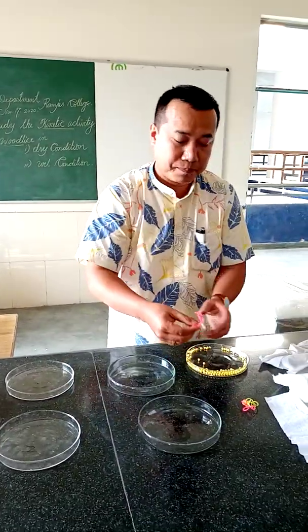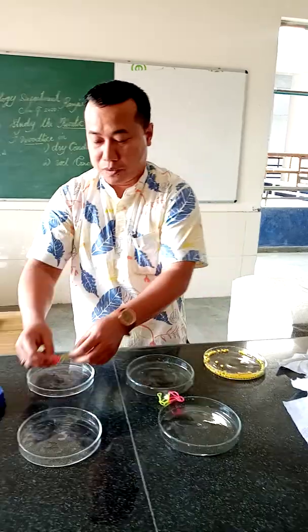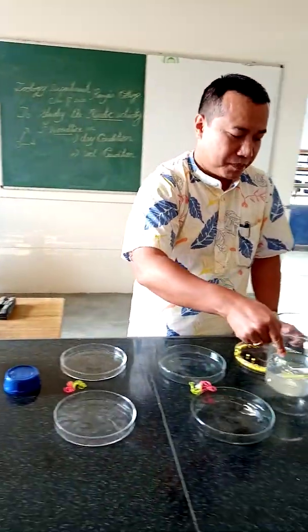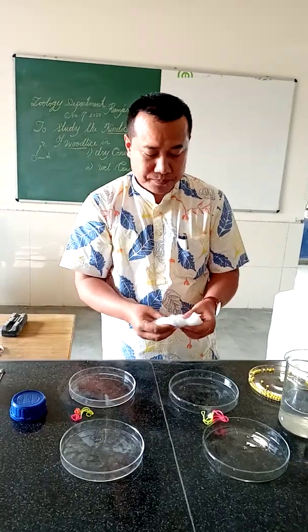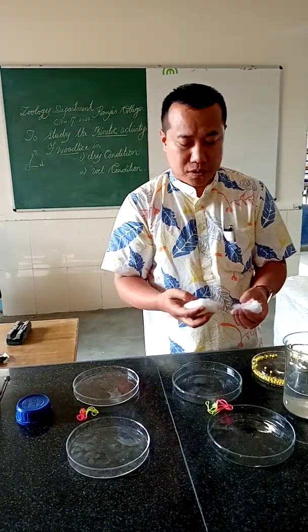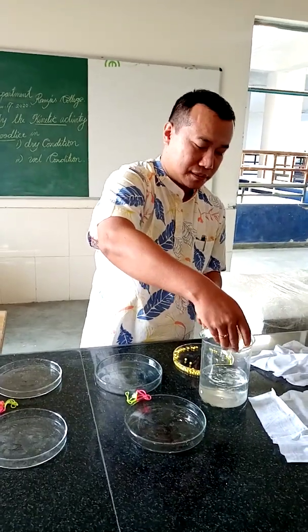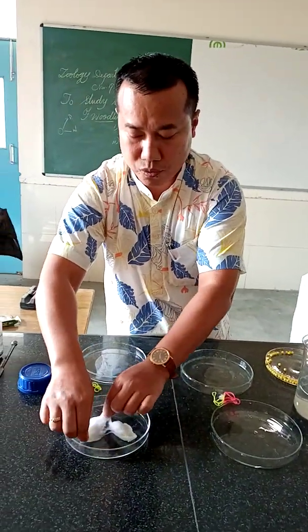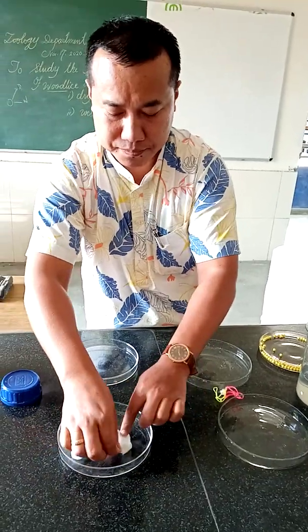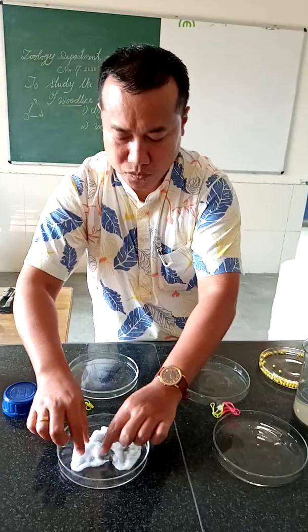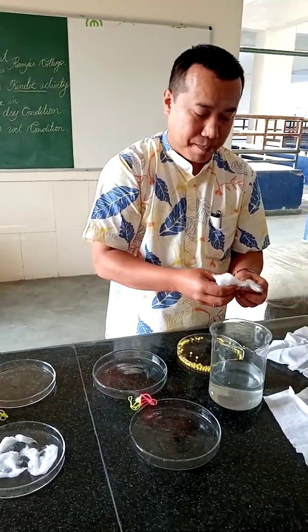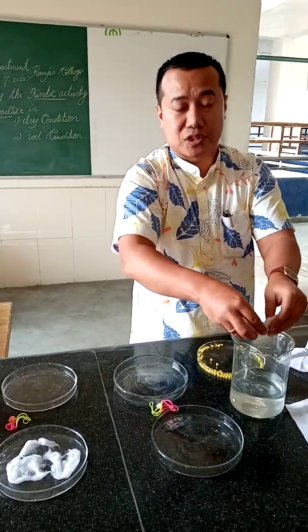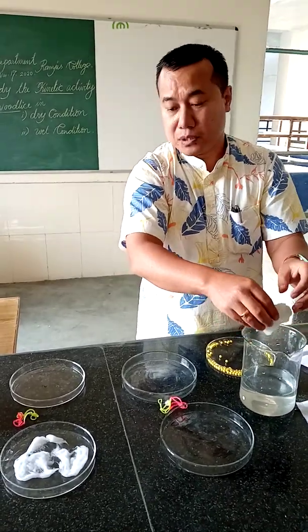This will be the dry conditions and this will be the wet conditions. To make the wet chamber, I have a beaker which already has distilled water in it. With the help of cotton, we will make a cotton swab, and we spray this cotton swab in this particular chamber. Don't flood it, but make it wet without flooding. As we already know, this particular animal is a crustacean and crustaceans usually respire with the help of gills, so they need wet conditions.